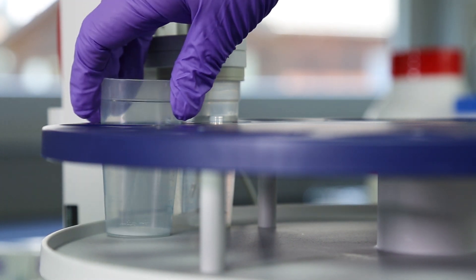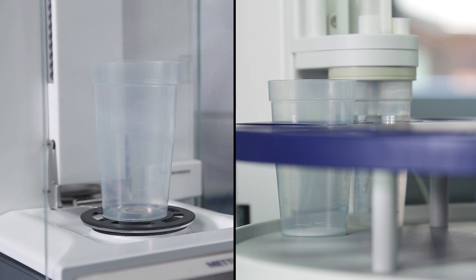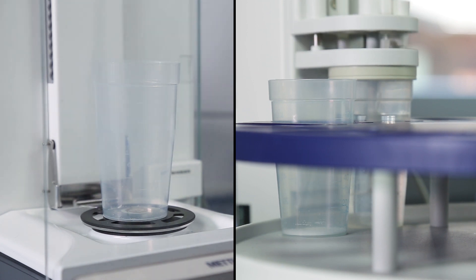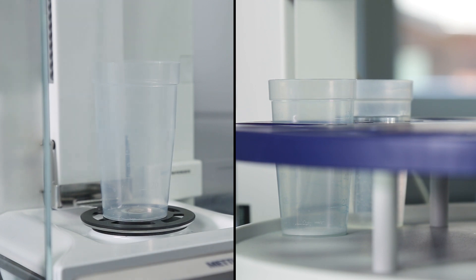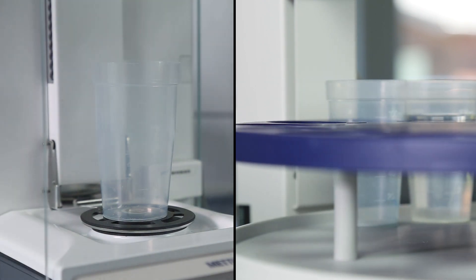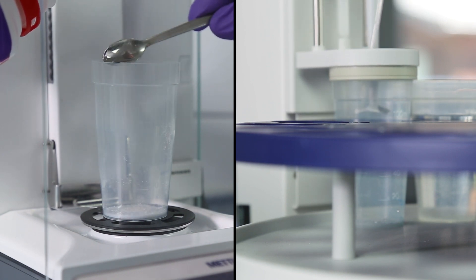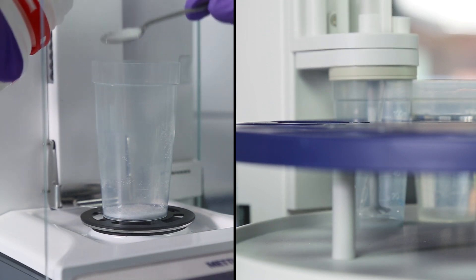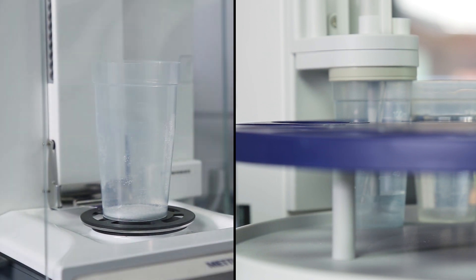The prepared titration sample is then immediately transferred to the RFID reader-equipped auto-sampler. Note that the first titration is now started whilst the technician prepares the second titration beaker on the balance. If any type of mistake in the titration process should occur, it will be uncovered now and the sample can be restarted. But the other four samples are still good to go, unlike with batching.